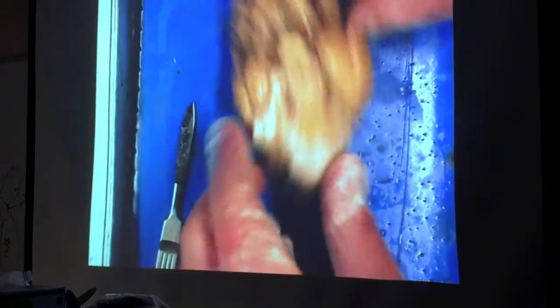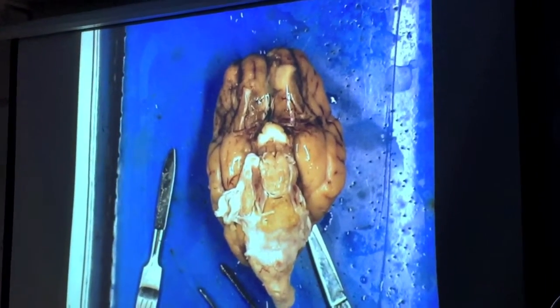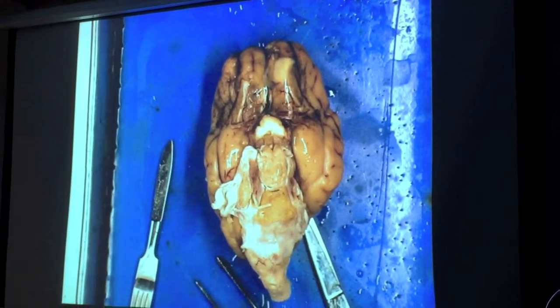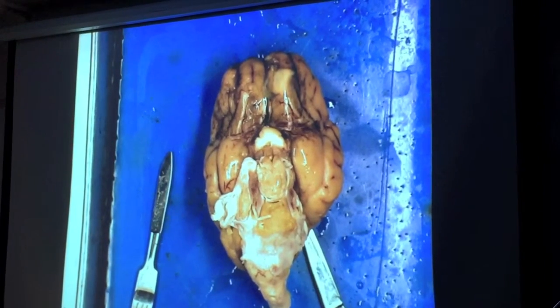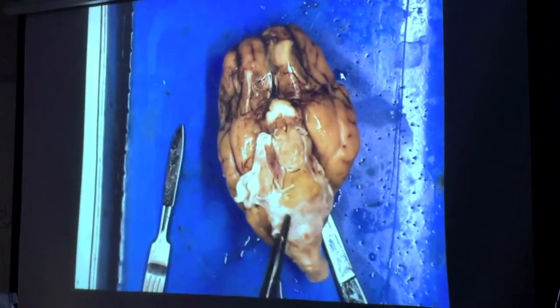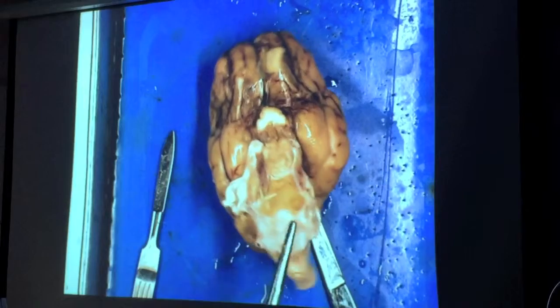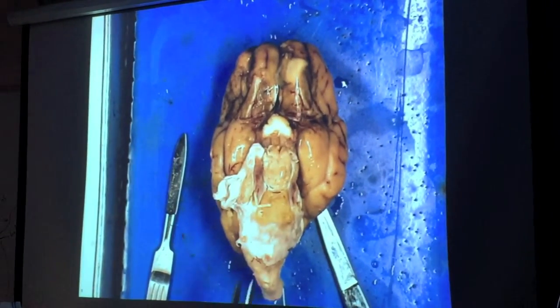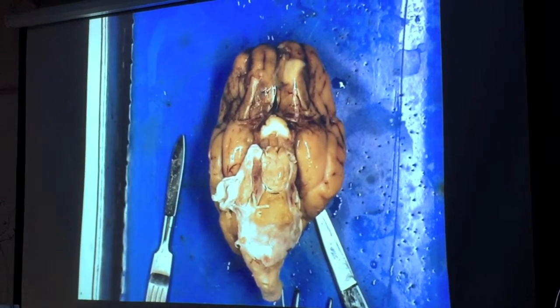Side, we flip it over, we'll see it doesn't have the sort of obvious cerebral cortex type structure because it has a bunch of other things on here that are going on. The first thing you should find on all of these brains, it seemed like all of them had it as I was handing them out, is this sort of white, tough membrane that's attached to the area around the spinal cord. That is the dura mater.